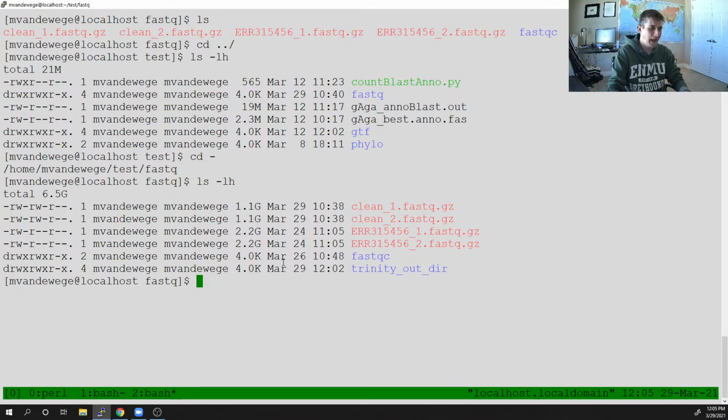I do already have a Trinity instance running. Unfortunately, I started it this morning, hoping it would finish before class started, but I ran into problems with an input file. One of my input files was in a poor format, and I had no idea how it happened. So I had to rerun Trimmomatic, remake my clean reads, and that seemed to work. If you see a failure of Trinity because of the input reads, just re-clean them and try again. Hopefully it will go away.